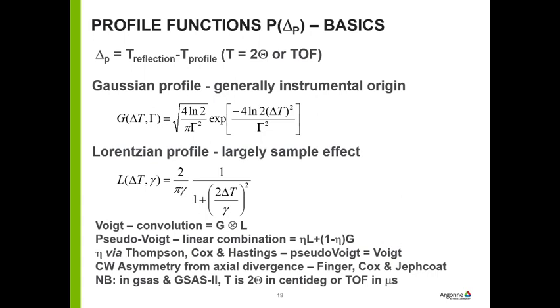This is then combined, if you convolute the two together, which one can do in a computer, but it's really tedious and expensive. There's not a known mathematical function for that convolution, apart from the name, which is called a Voigt. So we use a pseudo-Voigt, which is a lot cheaper, where you have a mixing coefficient, eta, and eta is determined via Thompson-Cox-Hastings. And the important thing about what they did is they made the pseudo-Voigt equal to the Voigt mathematically, within a few hundredths of a percent.